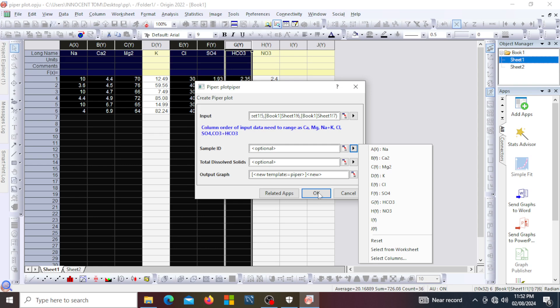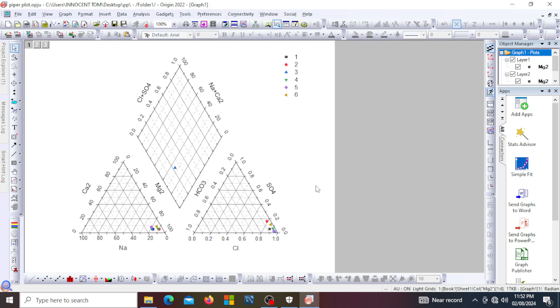When you've done that, click OK and this is our Piper plot — a Piper plot showing us the distribution of the anions and cations in water. A Piper plot, which is also known as a Piper diagram, is a graphical representation used in chemistry, geochemistry, and hydrogeology to display the chemical composition of water samples. It shows the major ion concentrations of the water sample.